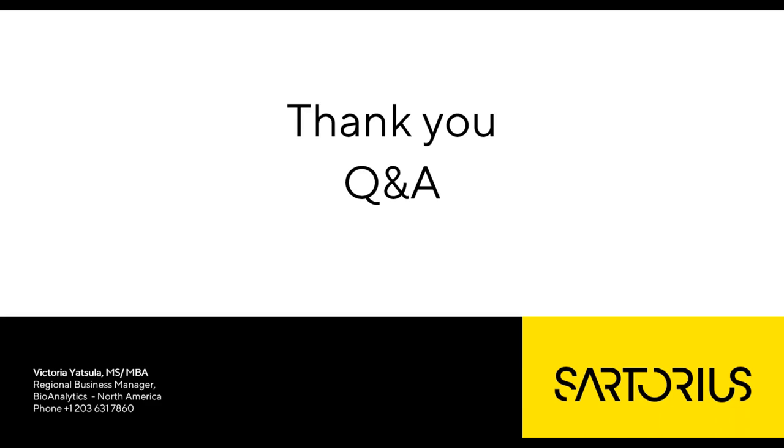Thanks, Minnie. One more question for you. Can I image fluorescently labeled organoids, and can I perform 96 well embedded assays using this module? Fluorescent imaging is not supported for this module. Only label-free quantification is available. And as I mentioned earlier, this organoid QC module enables real-time kinetic visualization and quantification of organoids embedded in Matrigel domes in 48 and 24 well plates only. So downstream 96 well applications are currently not supported using this module. Thanks.